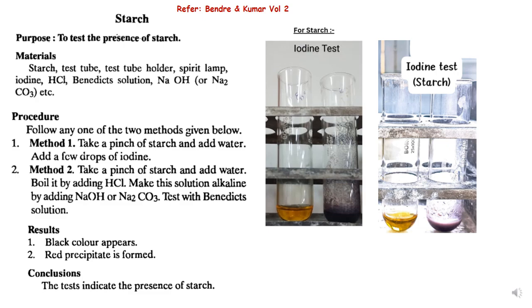So for this we have two procedures. First, you just take a pinch of starch, add some water and add a few drops of iodine, so the blue black color appears.